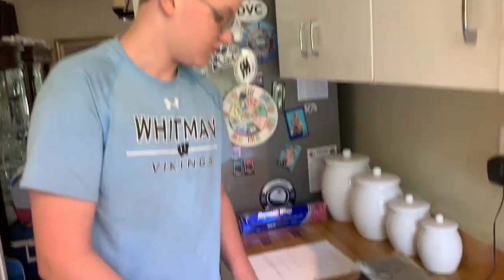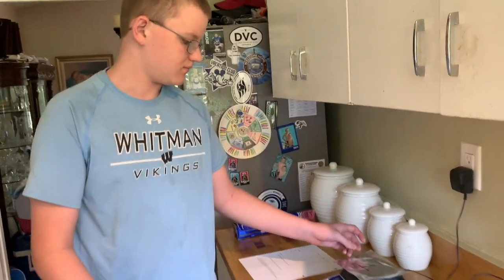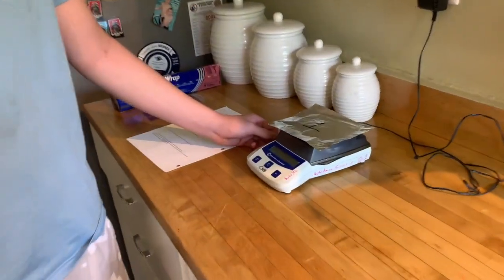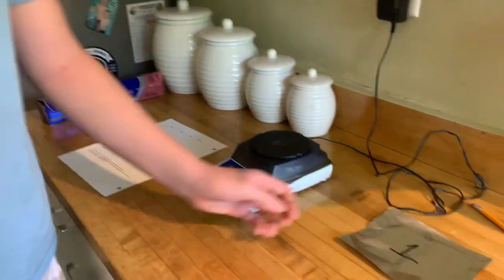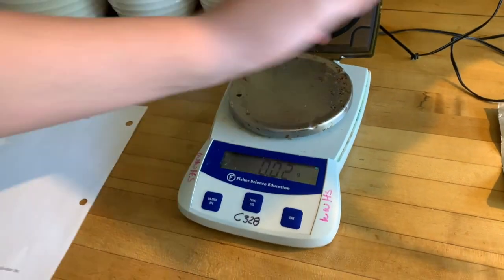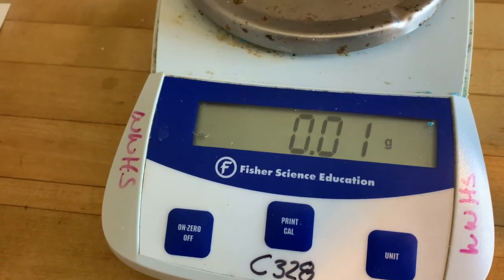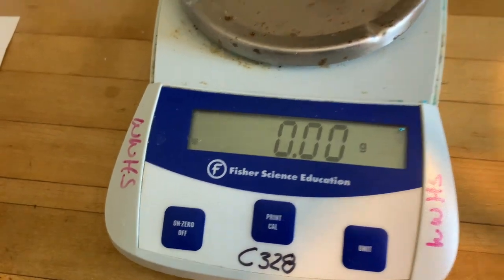What's the mass, Maurice? Zero. Is that possible? Does that piece of aluminum foil have mass? Yes. So what do you think is wrong? Maurice, let's look at this — this is our balance. Let's lift the lid of the balance. When using a balance, make sure it always reads zero. If it's not, like now, you're gonna hit the on button, which zeros the balance. Great, okay, go ahead.